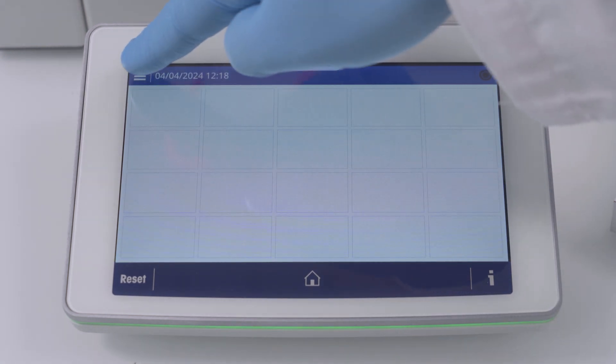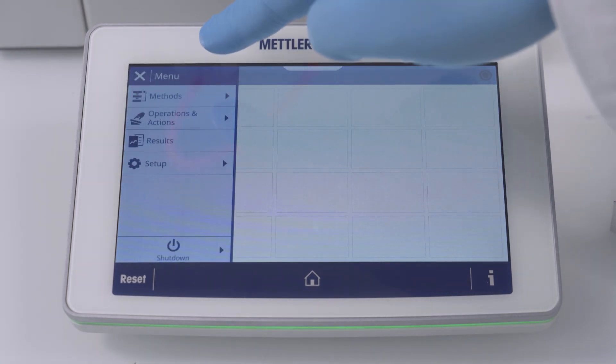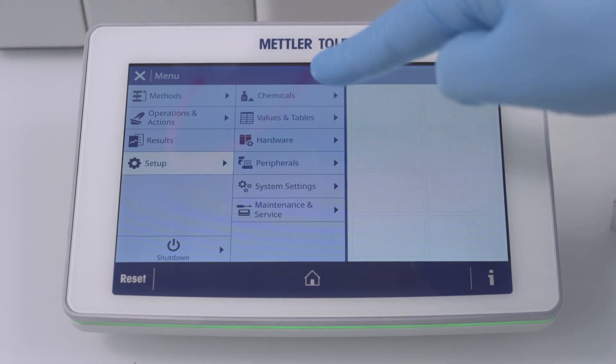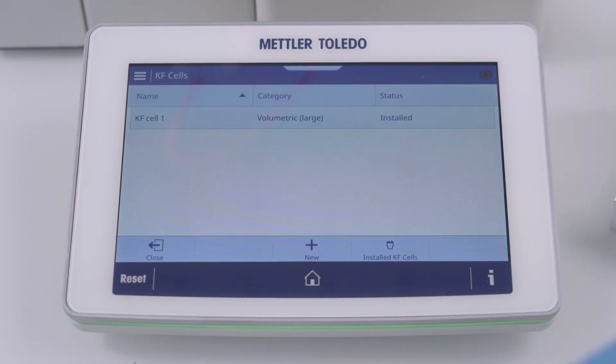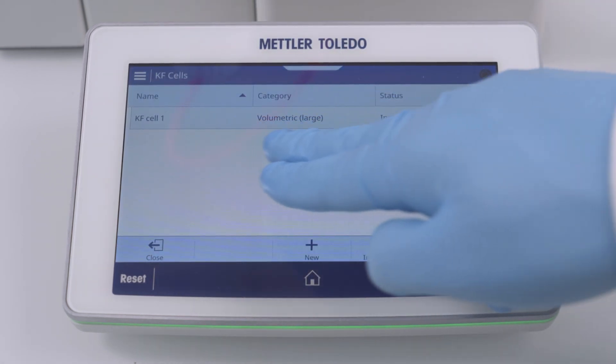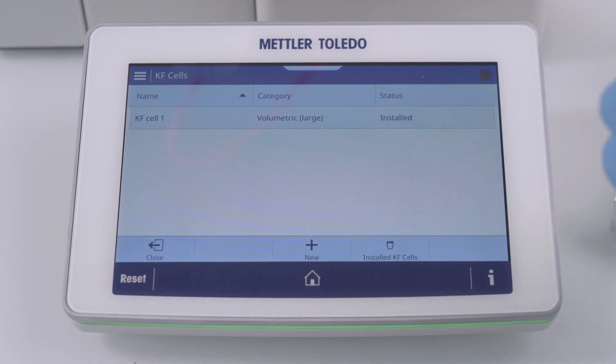The KF cell does not need to be created. There already exists a default KF cell under setup hardware. Nevertheless, we need to check if it's configured correctly. Means to check if the physically installed KF cell matches the one configured in the setup. In this example, we use the large KF beaker to measure. The resource entry is therefore correct.